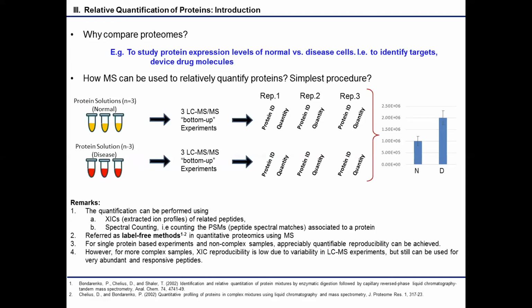I think the other things, building off what we were talking about earlier, are good to talk about. One of the challenges with Western blots is that you have to make sure that you have a high quality specific antibody. That's really difficult to actually obtain. It's more difficult than what we might anticipate. A lot of times we trust vendors to tell us that antibodies are good for Western blot, but obviously they are not unbiased in their assessments because they're selling us these resources. That's something you really should consider when you're trying to do things in an unbiased fashion.